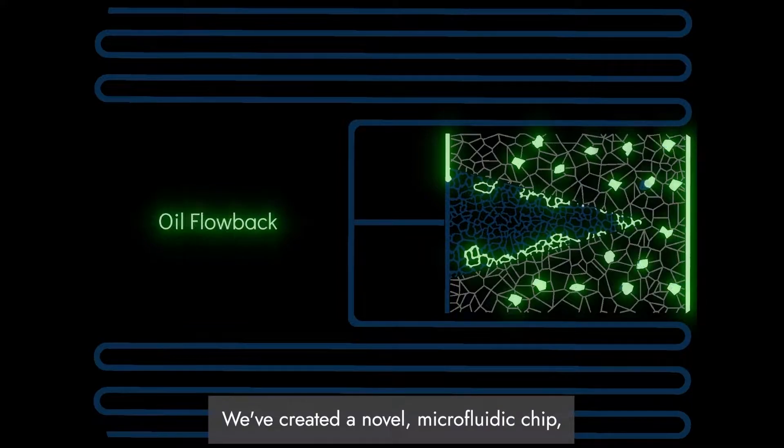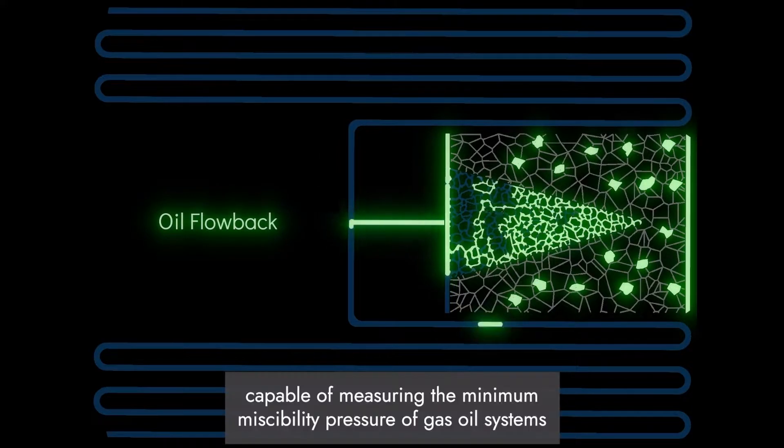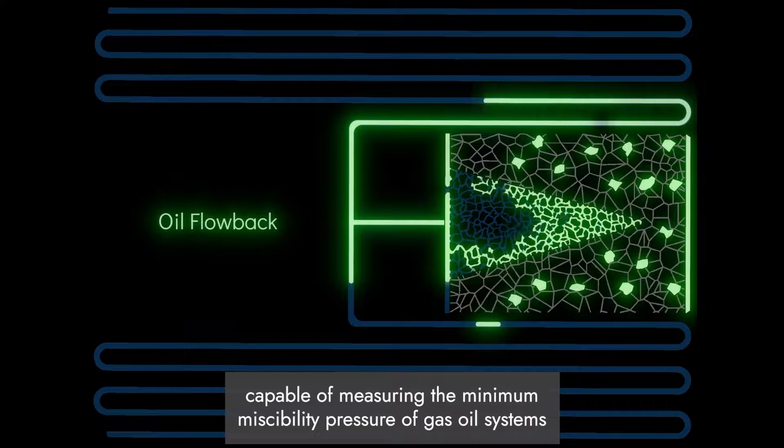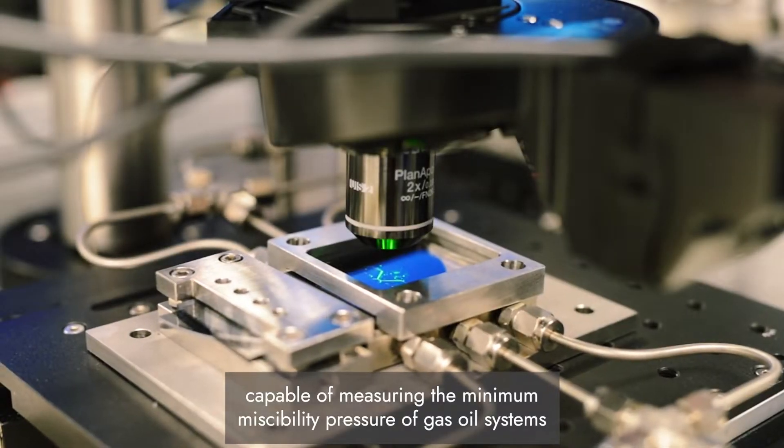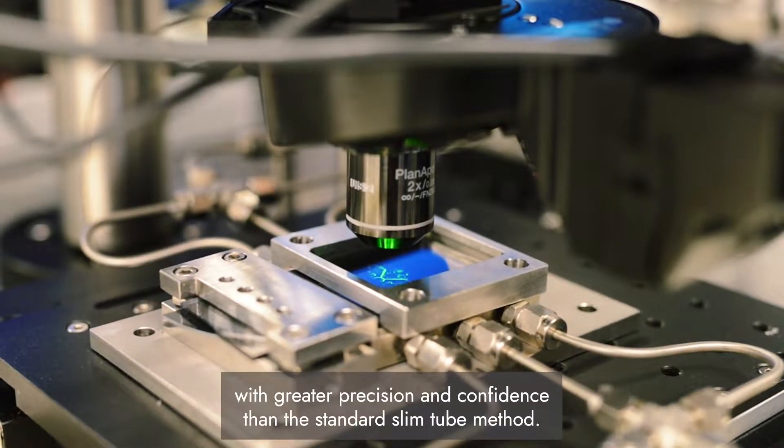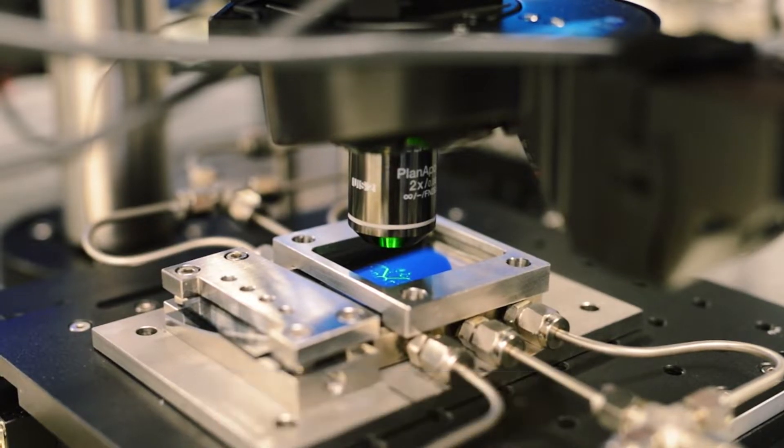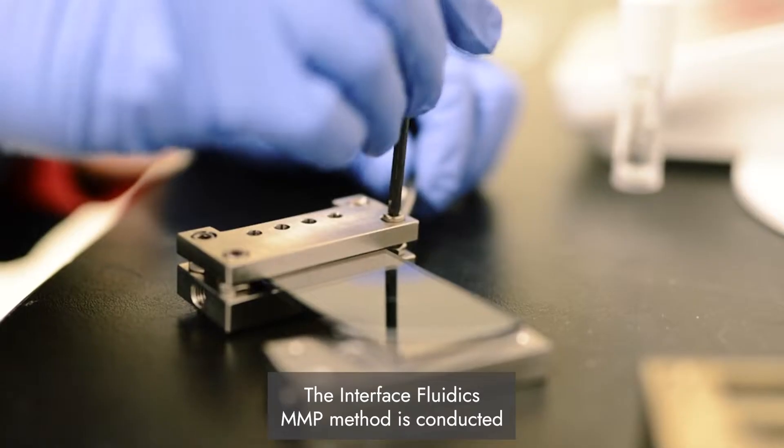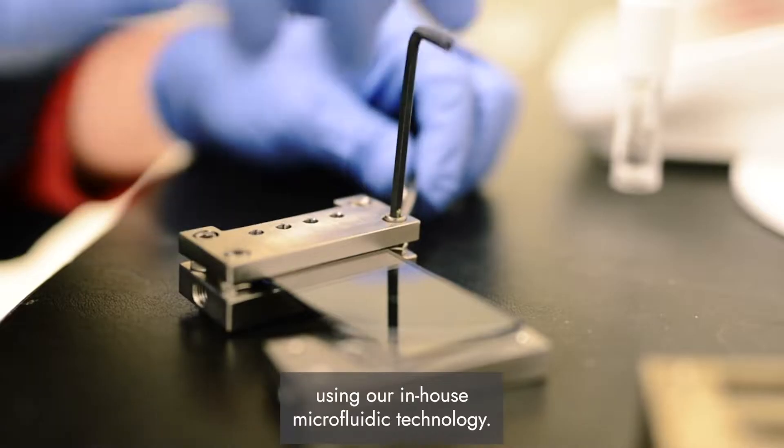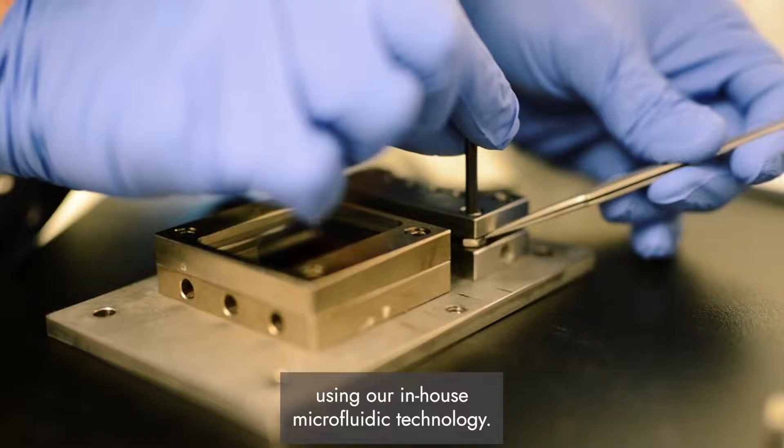We've created a novel microfluidic chip capable of measuring the minimum miscibility pressure of gas oil systems with greater precision and confidence than the standard SLIM tube method. The Interface Fluidics method is conducted using our in-house microfluidic technology.